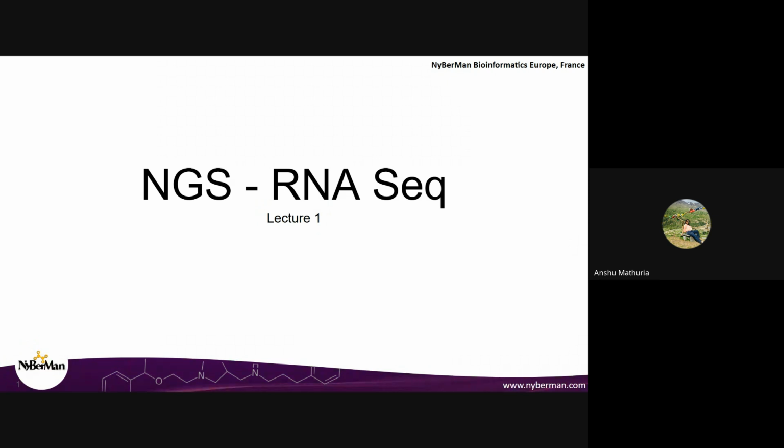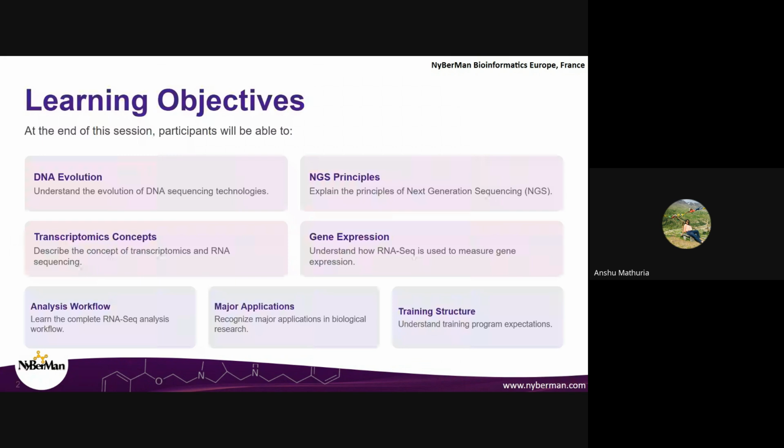So in this particular lecture, as this is the first lecture, it is going to be a little basic. You guys might already know about it. It might be a repetition, but as it's the first lecture, we'll start from the entire basics and we'll move further step by step. So in this lecture, we'll be basically covering the basic concepts of transcriptomics, and we'll learn about the principles of RNA-seq and the workflow.